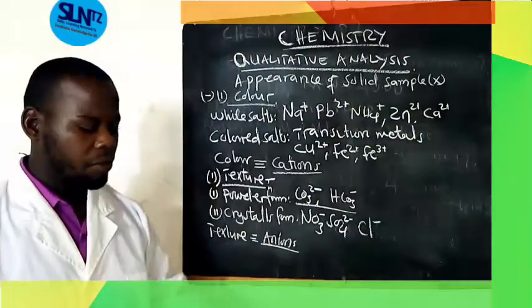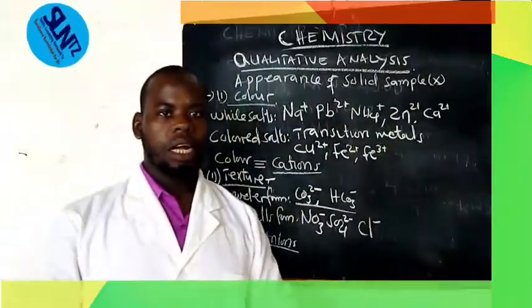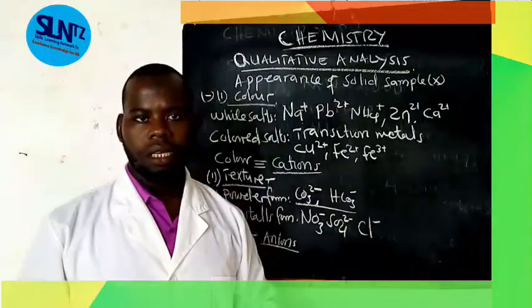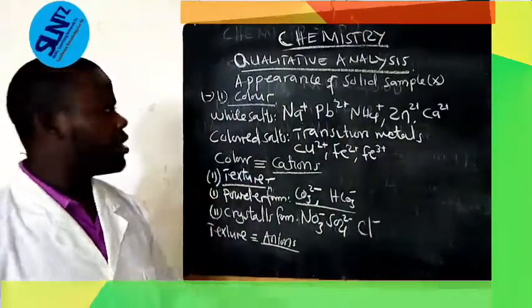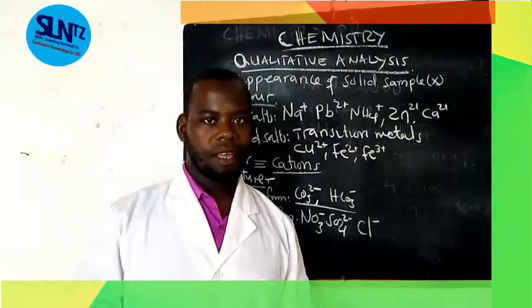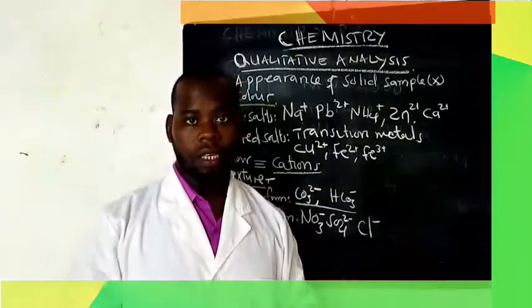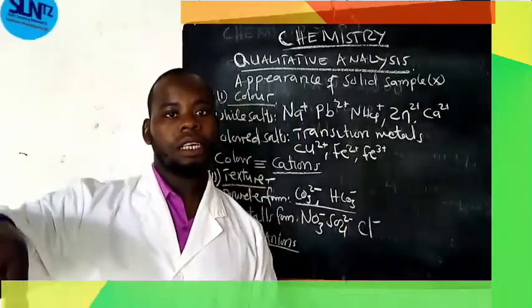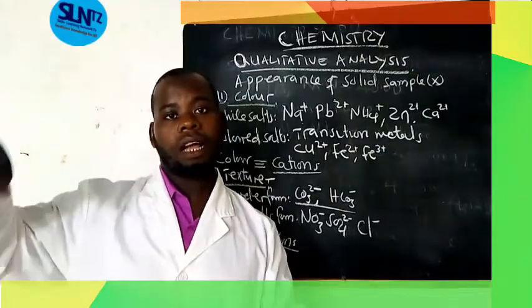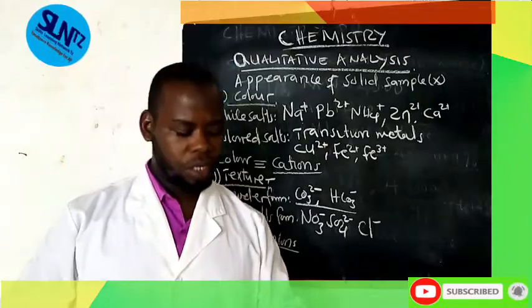Say I have got the blue crystals. On the confirmation you cannot write lead confirmed. No relationship between white and the lead. Do you see? No relationship.